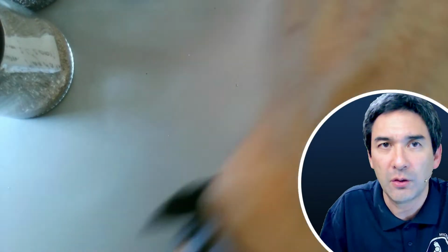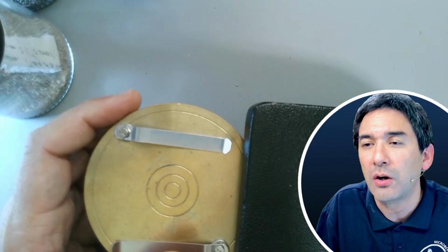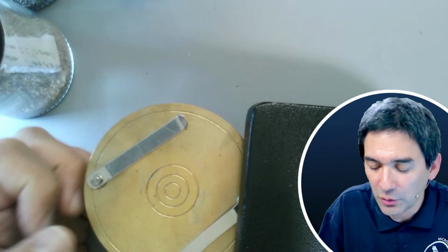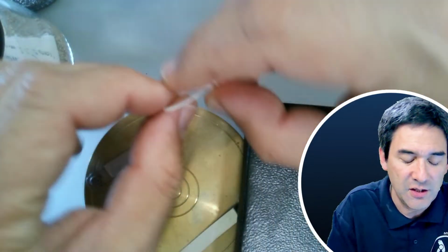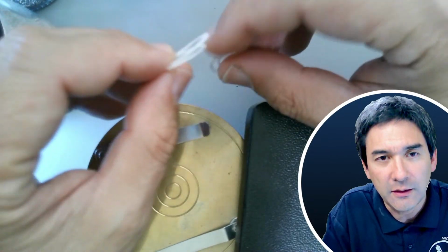I've seen several people who are actually making their own things here. Someone asks: please, would you tell us how thick your 3D printed distance rings are, and working with the ringing table and reinforcing rings, Verstärkungsringe für Aktenlochen. So what I made is those two. I got two different arbitrary thicknesses here, 0.5 millimeter and 1 millimeter. And I will tell you what the problem is.